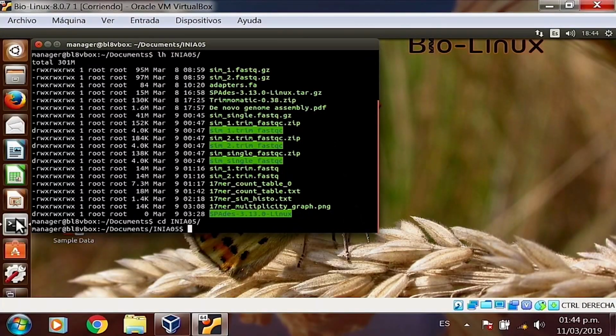We're going to take a quick, closer look at that plot to understand what it means, to make some final recommendations, and then we're going to submit an actual assembly job. All right, you ready? Your build box? Okay, cool. You're ready now.